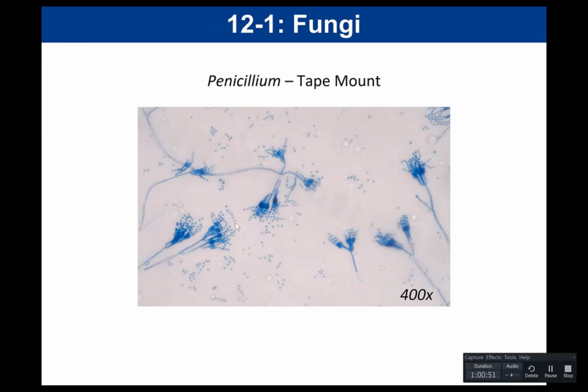So again, for these fungi, you should identify them by their plate. You should be able to identify what they look like in their tape mount, as well as what they look like in their slide culture. And so those are the things that you need to know for the fungi.